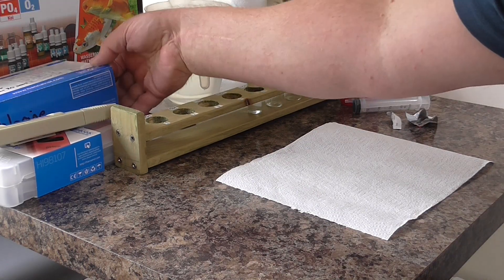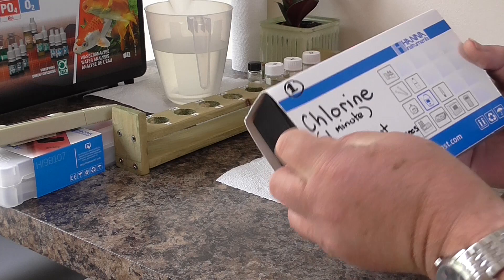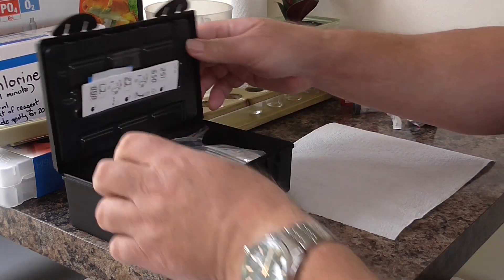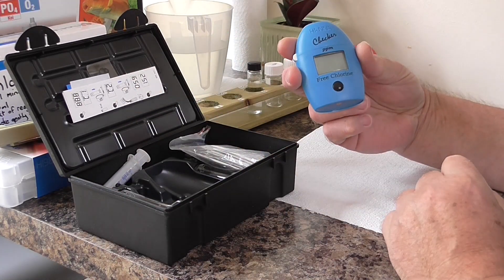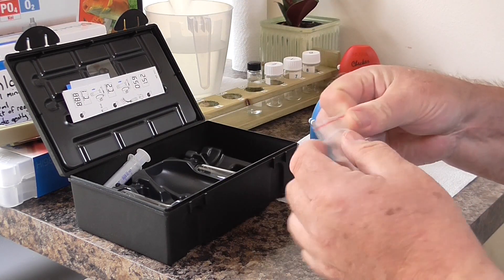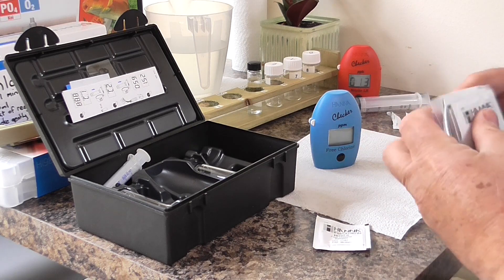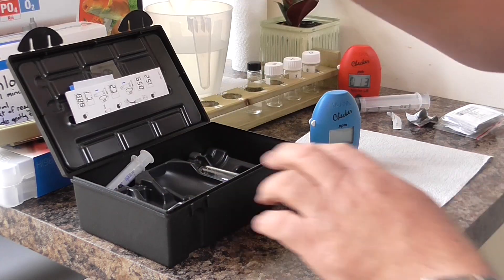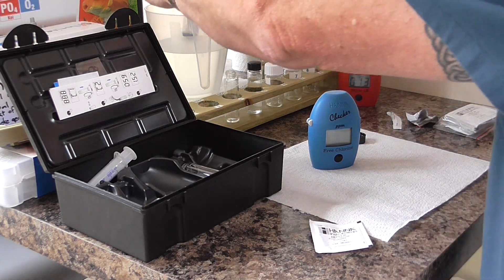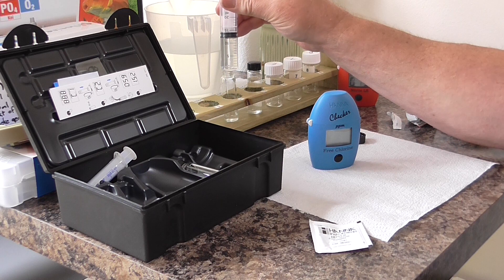Next test we're going to do is chlorine. This is the chlorine test. Again we've got the meter, some reagents — get one out — and a test tube to put the 10 millilitres of pond water in. So we get the 10 millilitres in here.